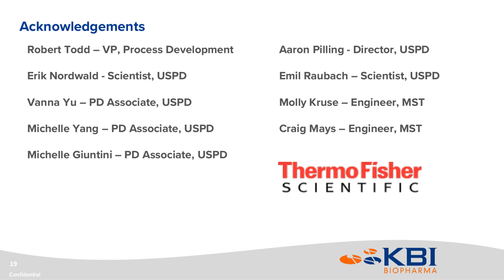Yeah, also a good question. So in general, the hardware for the system is going to be your least complex part. It's a pretty simple system at first glance when you're looking at the jacket and the controller and the pumps, and it's fairly simple and intuitive. Really the training and most of the resources go towards the controller and the software around the system.